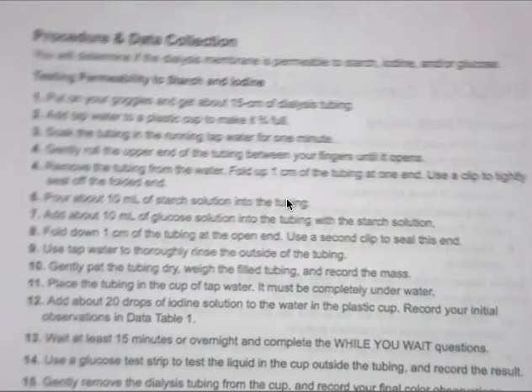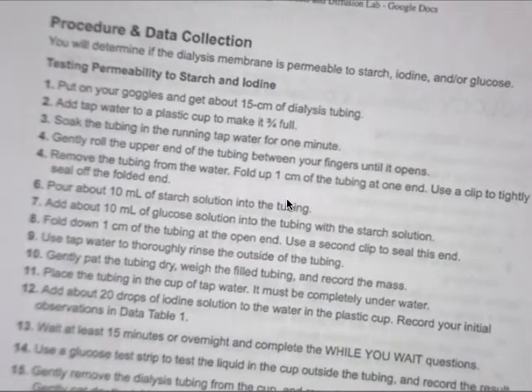So the procedure says you will determine if the dialysis membrane is permeable to starch, iodine, and/or glucose. Testing permeability to starch and iodine. Number one, put on your goggles and get about 15 centimeters of dialysis tubing. This is the dialysis tubing right here. Add tap water to a plastic cup to make it 3/4 full. Number three, soak the tubing in the running tap water for 1 minute. Number four, gently roll the upper end of the tubing between your fingers until it opens.